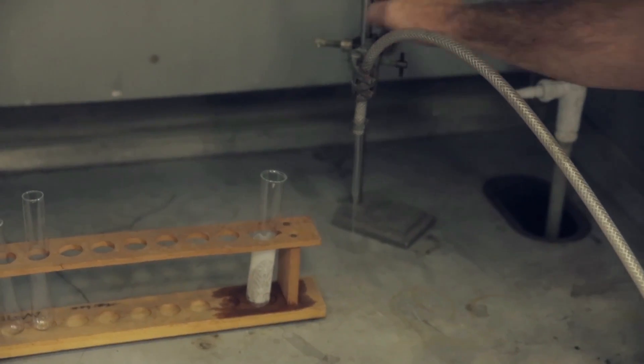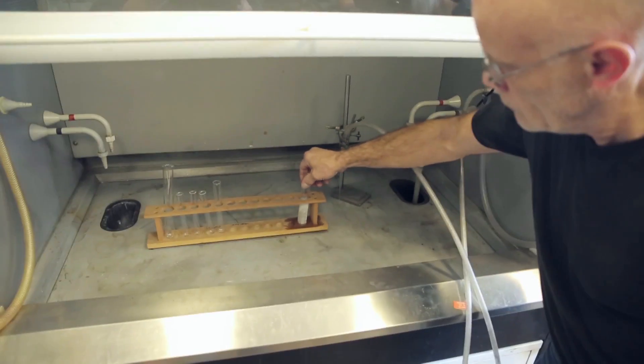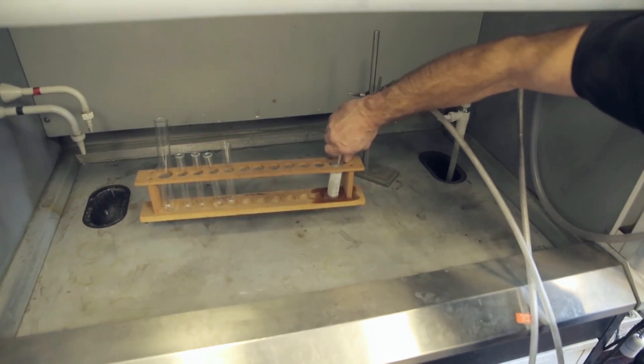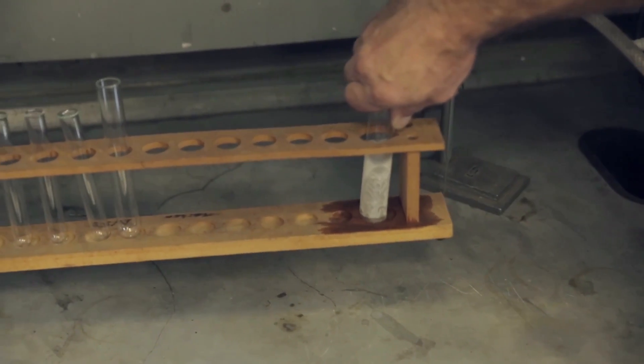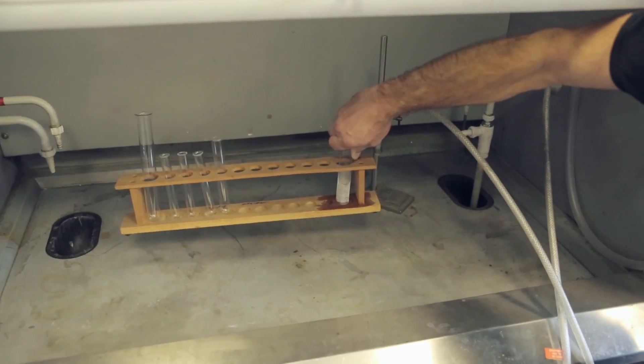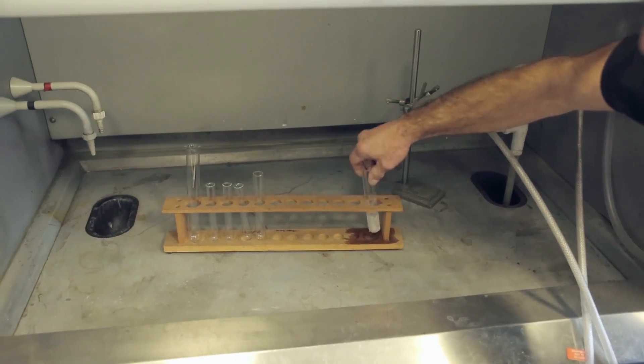And the image that really stuck in Neil's mind was his teacher, Mr. Mouncer, lifting up the test tube and the whole rack coming with it. Neil thinks it's pretty remarkable that you can freeze water just by the evaporation of the ether.